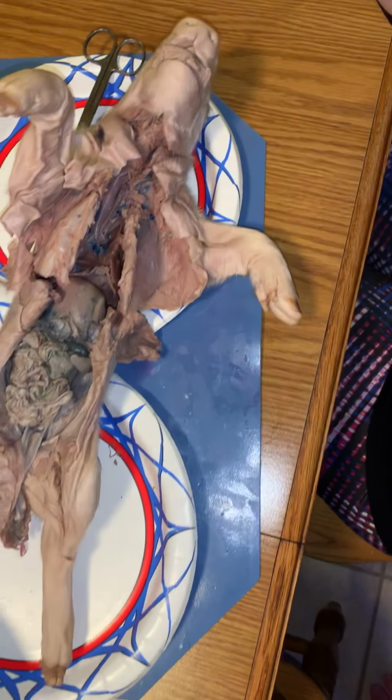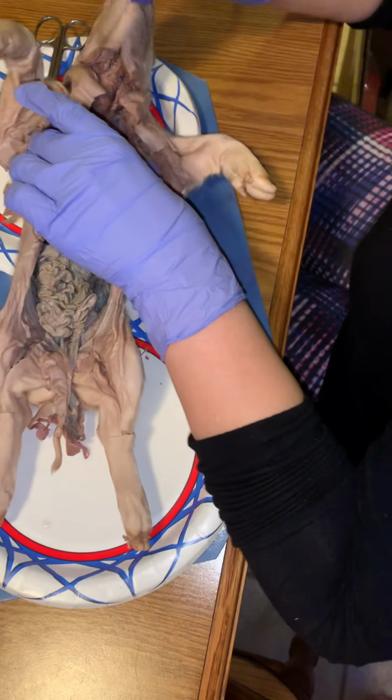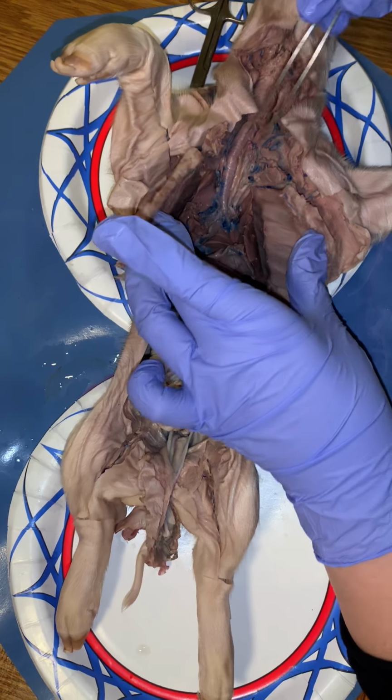Then we'll move into the chest cavity, the thoracic cavity, really quickly. And our esophagus is right behind the trachea. I tried to pull it to the side best I could. You can see it running down here.